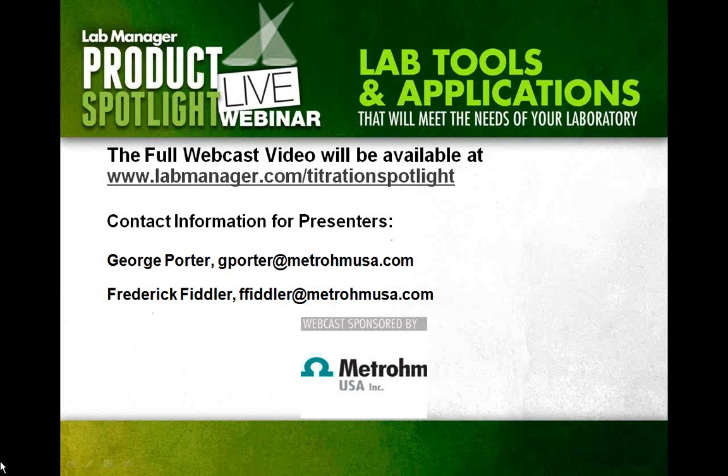I'm assuming that this is referring to a Karl Fischer determination. Was that specified? No, unfortunately that wasn't. Okay. Just from the way that the question is structured, my guess is that this is referring to a factor for the Karl Fischer titration, and then sample, and then doing the standard.